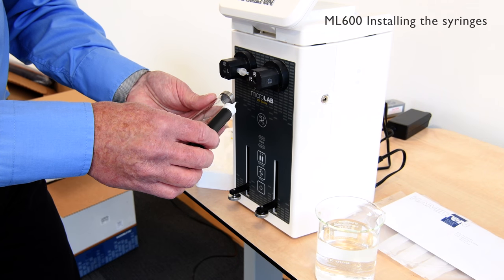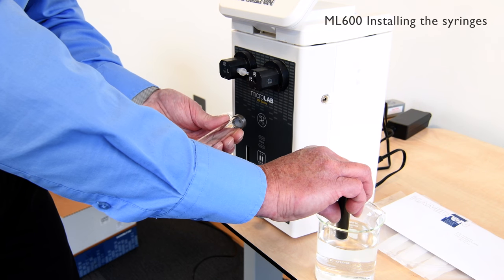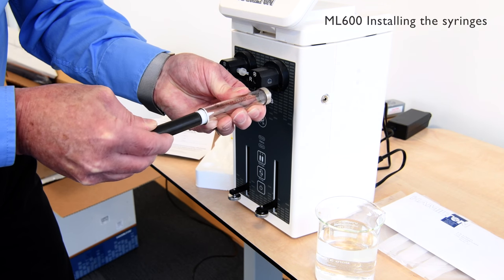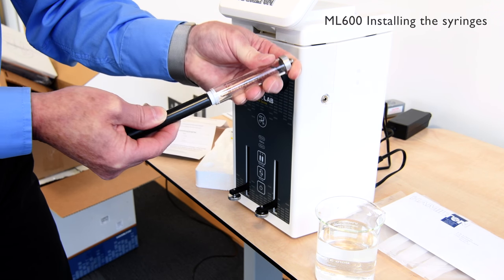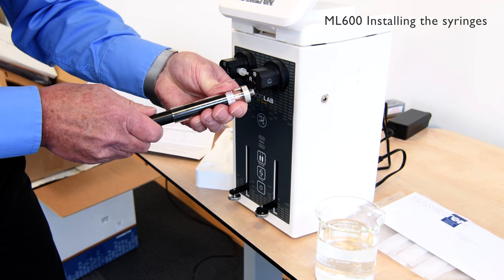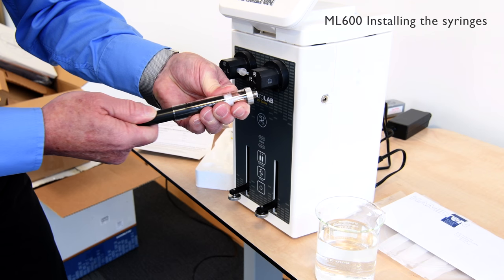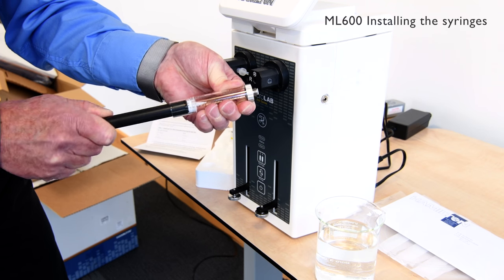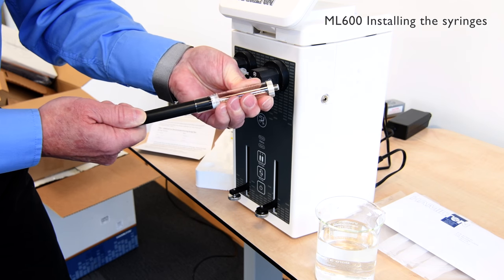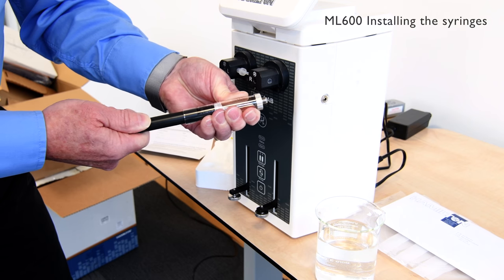So we're going to put the plunger into the syringe barrel, first wetting out the tip in some deionised water. Once it's actually in, we can move the plunger up and down the syringe a number of times — Hamilton suggests ten times — just to ensure smooth movement of the plunger in the syringe. This conditions the tip into the syringe barrel.